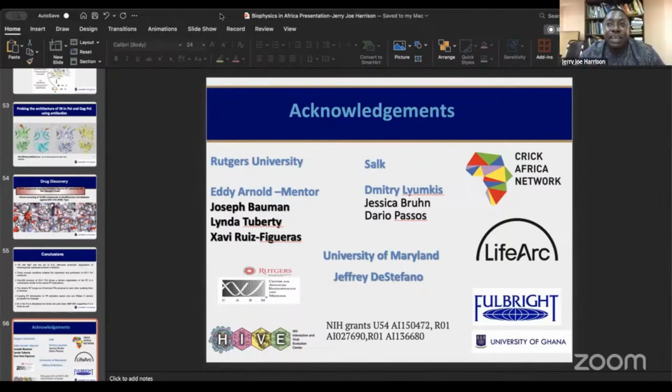The antibodies are not for the folding; they are for Western blot. What I want to use the FABs for is the flexible interdomains. These proteins are made up of multiple subdomains, and in between them there are flexible regions. Because of these flexible regions, we couldn't visualize them in the cryo-EM.